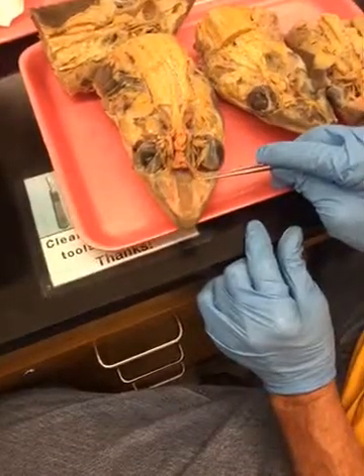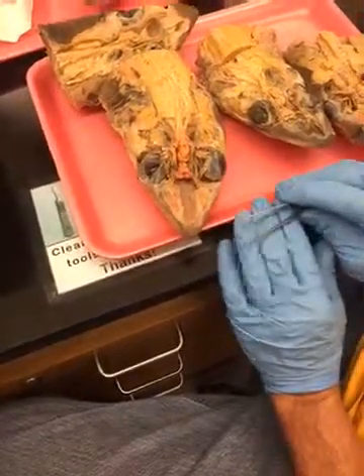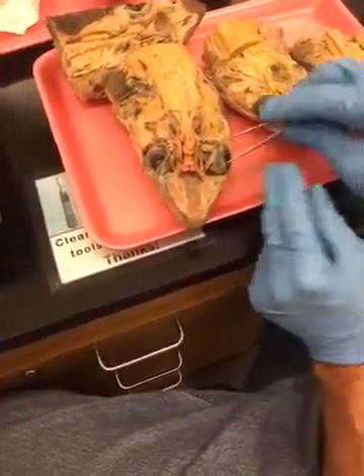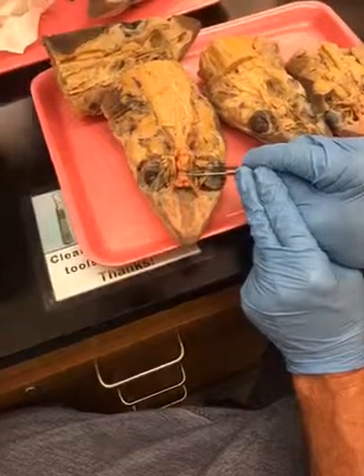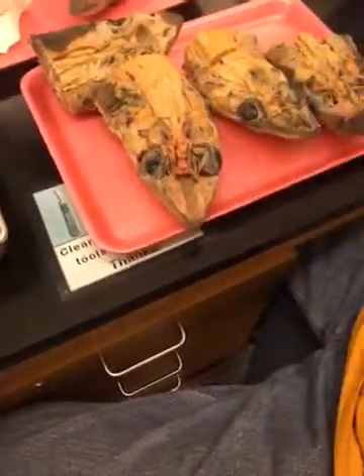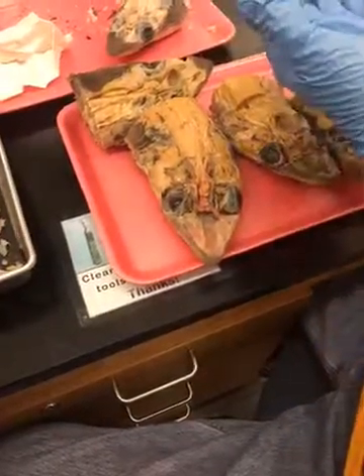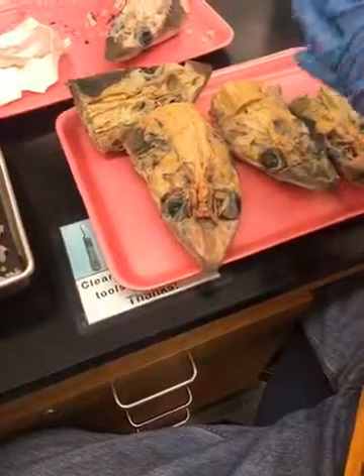Olfactory tract, olfactory bulb. That is the telencephalon. So the telencephalon is fairly large. Now, the diencephalon is just this region right there. And it consists of a roof, which is the epithalamus, sides, which are the thalamus, and the floor, which is the hypothalamus. So that makes it really easy.